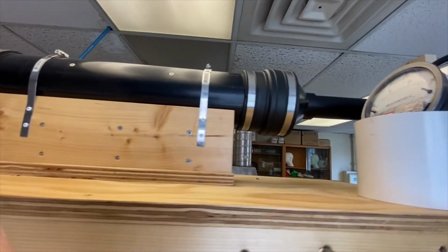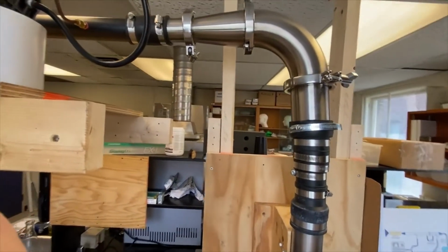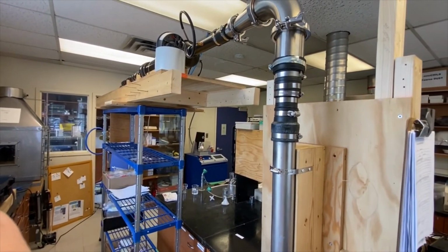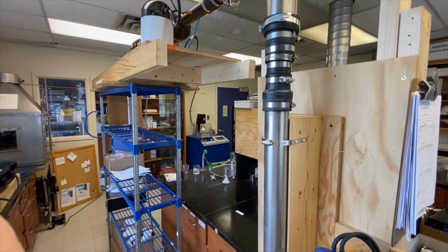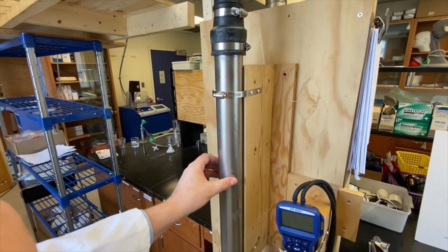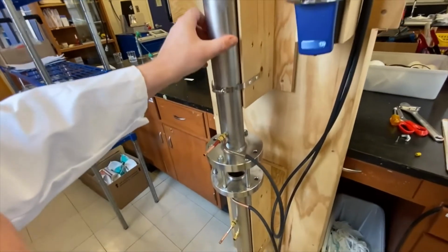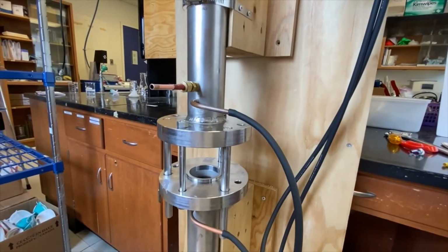So those tiny plastic beads in the air are then brought into another duct, and this duct is oriented vertically. In our earlier experiments, we were using a very large air velocity, which meant that we could keep the entire instrument horizontal, and gravity didn't really have much of an effect on the particles. We've recently been doing tests at lower velocity, and it's important at lower velocity that the particles are moving in the same direction as the gravitational vector. So those latex beads suspended in the air move down through this duct, and then here is a gap in the duct where we position our test object.